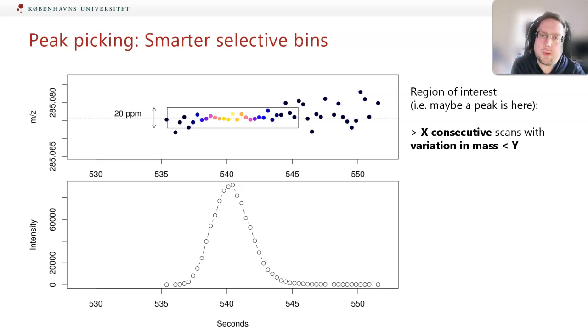We did the trick of combining bins to safeguard against that, but that means that we practically end up with very wide bins, much wider than the resolution of our mass instrument. So we are effectively throwing away accuracy, and we could end up combining things that do not belong together and that our instrument is perfectly capable of separating.